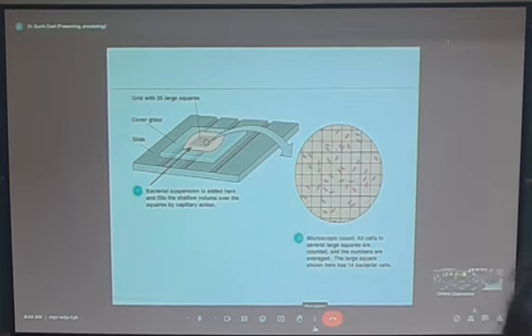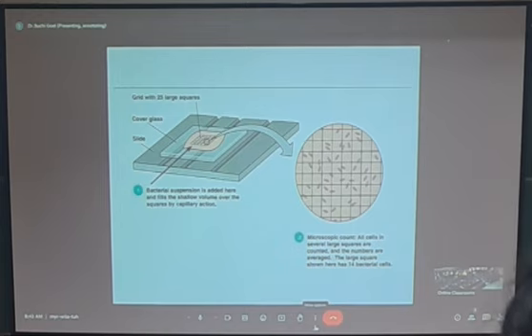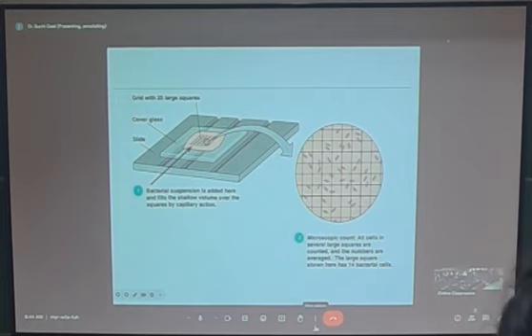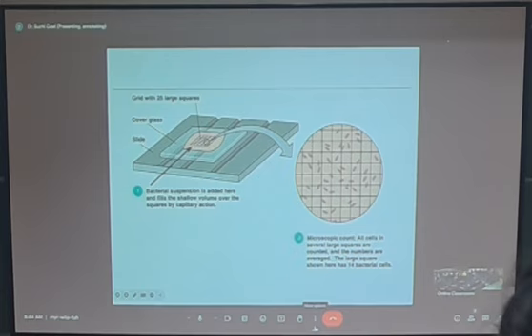Now what you do is, you take your bacterial sample, and you take only 10 microliters of it, and you put it under the hemocytometer, under a cover slip. Now what you will see is all your bacteria on the slide. Can you see the bacteria now?